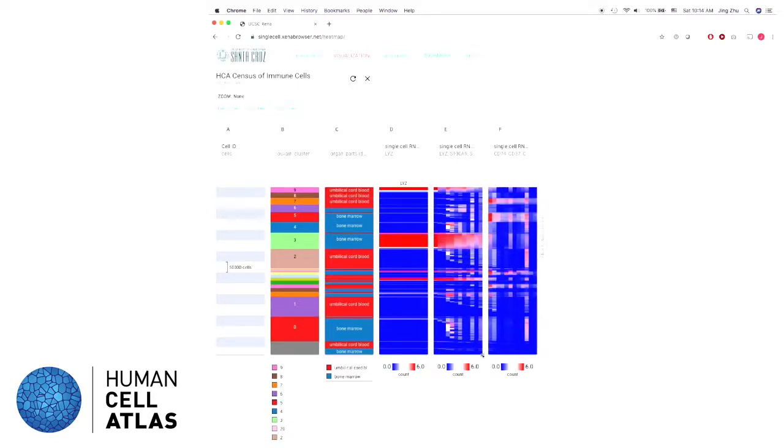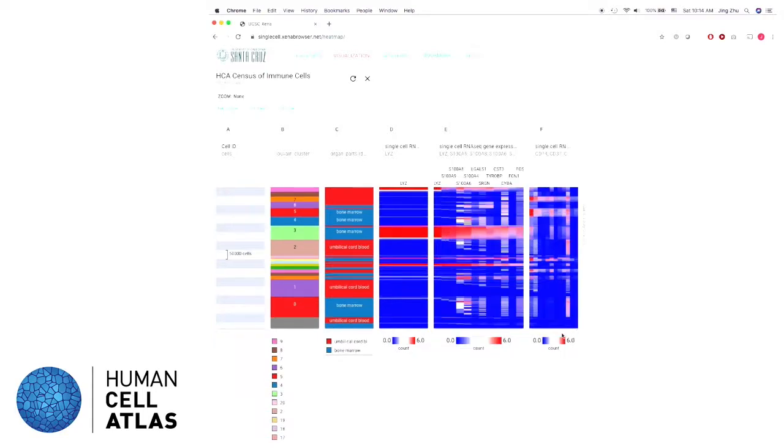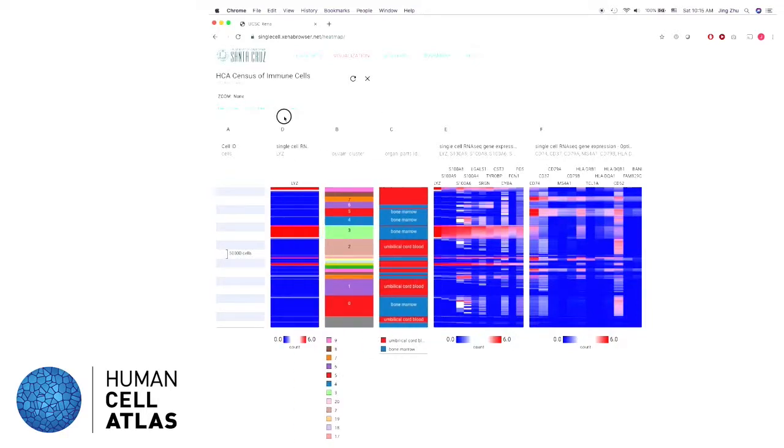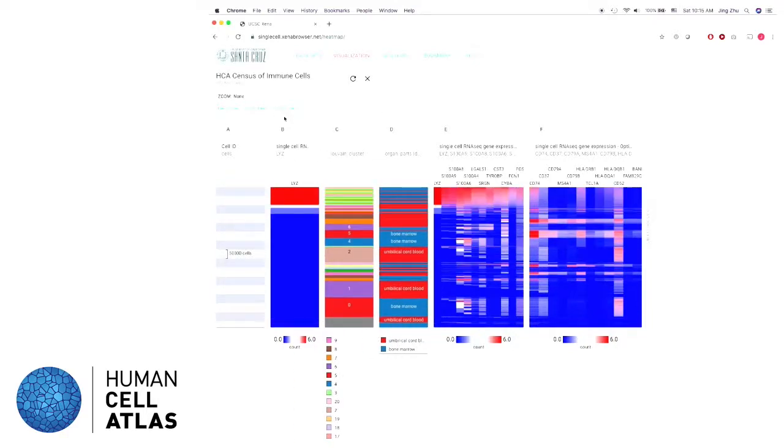You can resize a column dynamically once it's built. You can also rearrange columns. Here, after rearranging, all the 800,000 cells will be dynamically resorted in real time. In Xena, we always start sorting the cells first by the very first data column, column B, and ties will be further broken by subsequent columns from left to right.